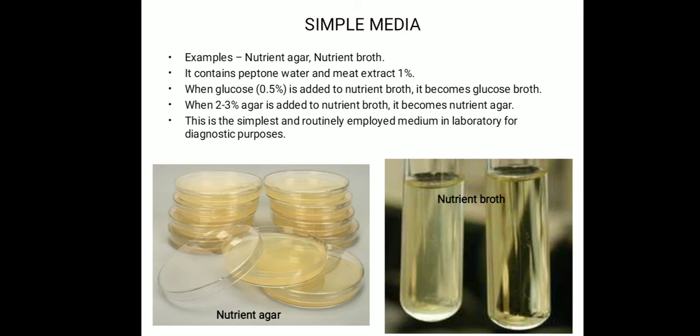They contain peptone water and meat extract around 1%, and when we add glucose to this nutrient broth, it becomes glucose broth, and when we add 2 to 3% agar to this nutrient broth, it becomes nutrient agar. These are the simplest and routinely employed media in the lab for diagnostic purposes.